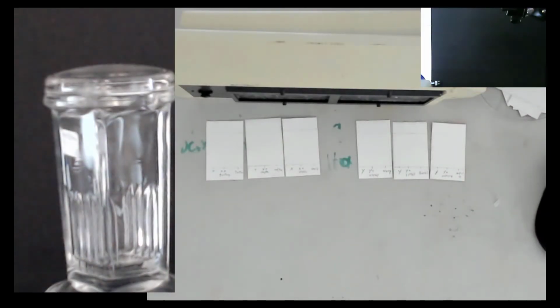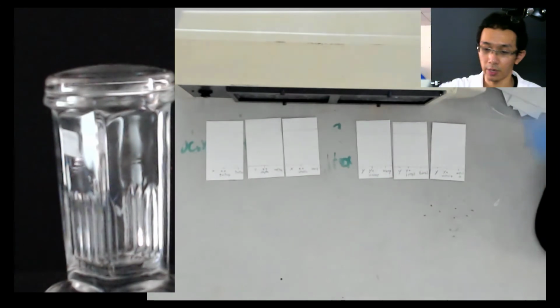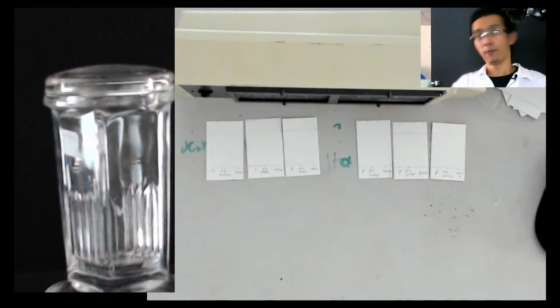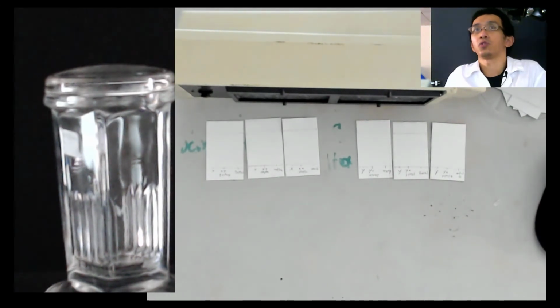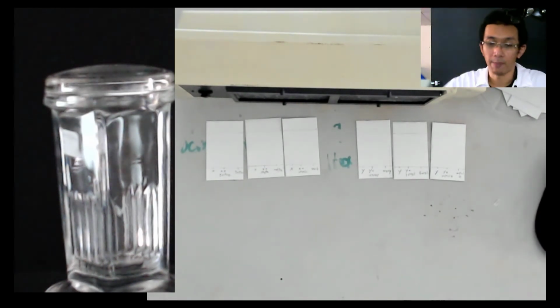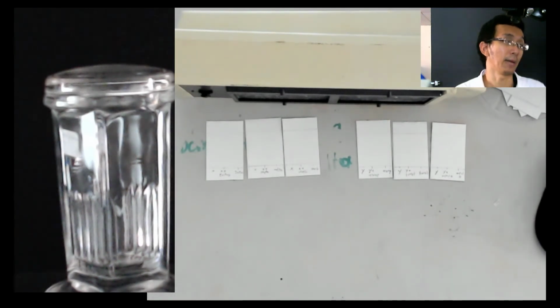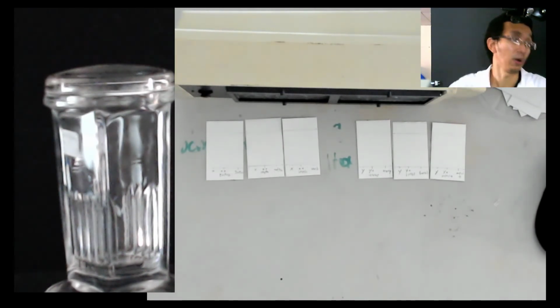So we are already at the end of our session. Maybe another 10 minutes, we are already done. Okay, now I have switched off the light in this lab. And one more thing, I'm wearing this shirt, this lab coat. Your lab coat or shirt can also prevent the UV light. That's why if you go to the beach and don't wear anything, you get sunburn. The sunburn is caused by UV from sunlight, so the shirt can block the UV light.